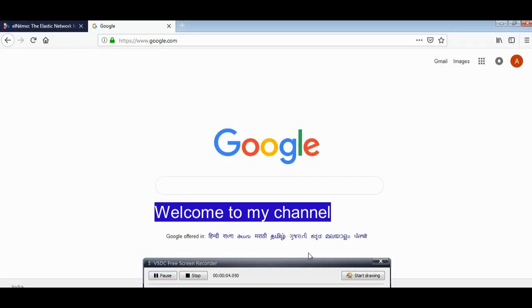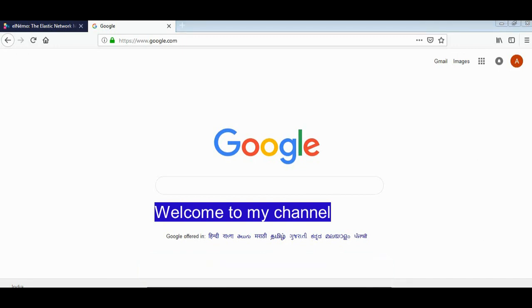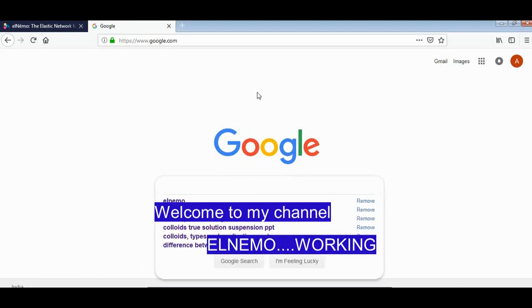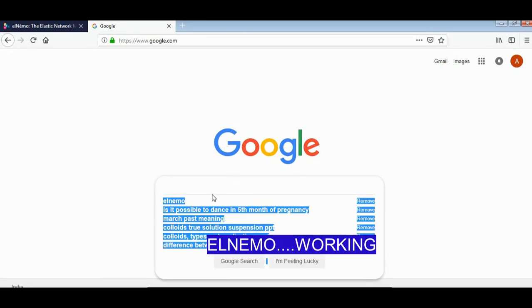Hello my dear students and viewers. Today I would like to explain the working of elNémo web server, a free web server used to check the elasticity of macromolecules. For this, just go to Google and type here elNémo and go to this first link.